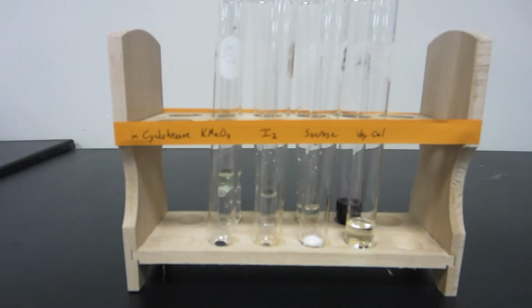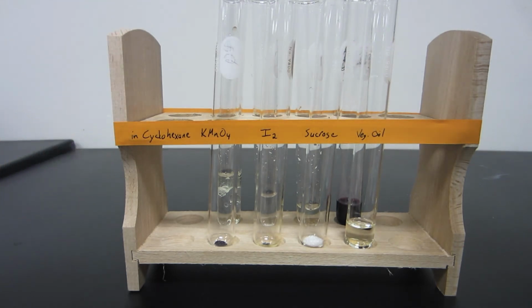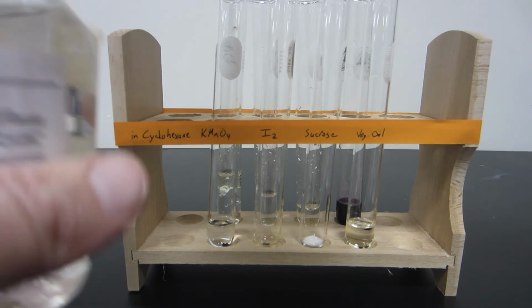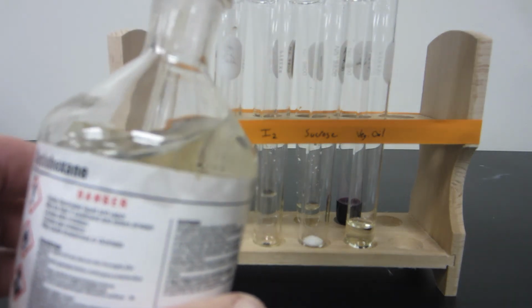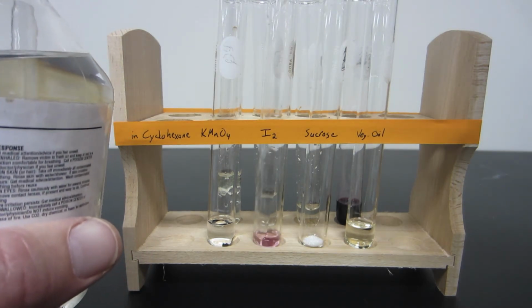And then for the other part of part A, we have the same solutes, and now I'm going to put cyclohexane in each sample. Cyclohexane actually smells a little bit like gasoline. It is a very common organic solvent. You can see it's just a clear and colorless solvent.